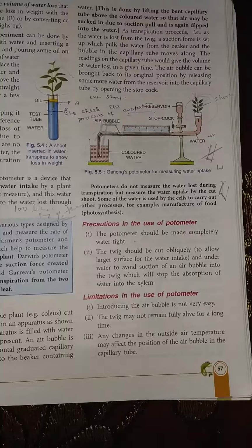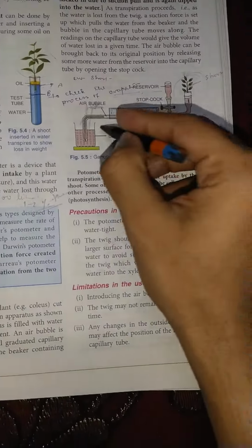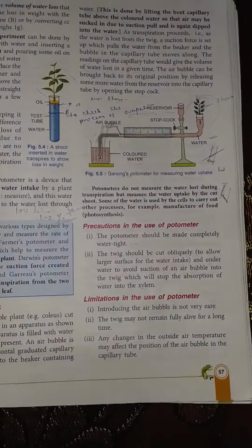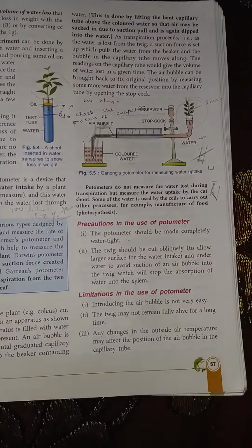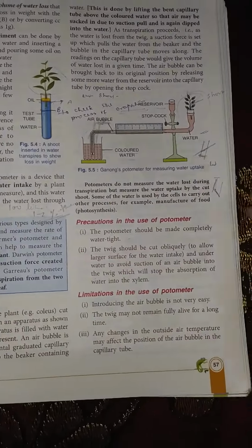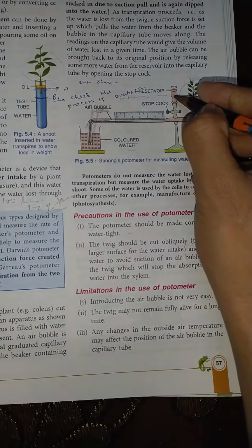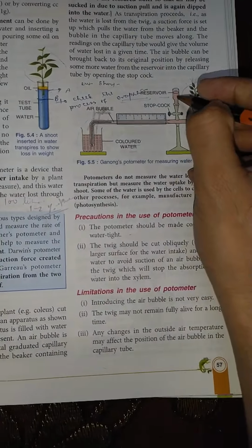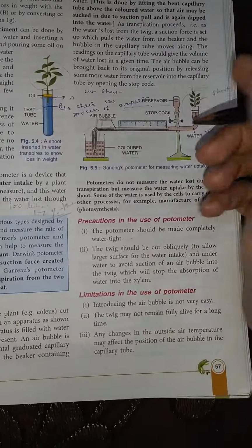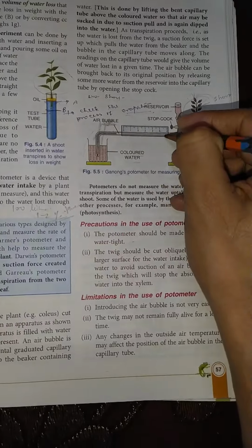Now I have told you earlier that I will tell you the function of the reservoir. Just suppose एक बार एक्सपेरिमेंट तुम कर लिए, रिजल्ट से सेटिस्फाई नहीं हो, या दूसरे बच्चे ये एक्सपेरिमेंट इसी सेटअप पे करना चाहेंगे, तो क्या फिर से हमको ये सब अरेंज करना पड़ेगा? No need. Just what you will do, ये एयर बबल निकालने का तरीका है कि ये जो रिजर्वायर में पानी है, the water that is present in the reservoir, just twist the stop cock, what will happen, this water will go inside the capillary tube.